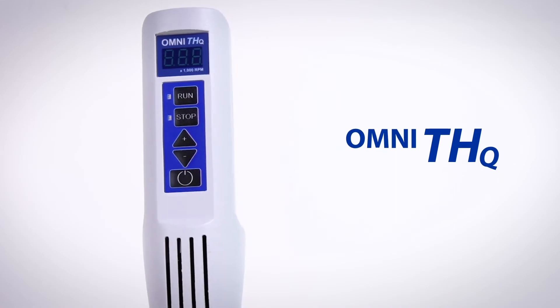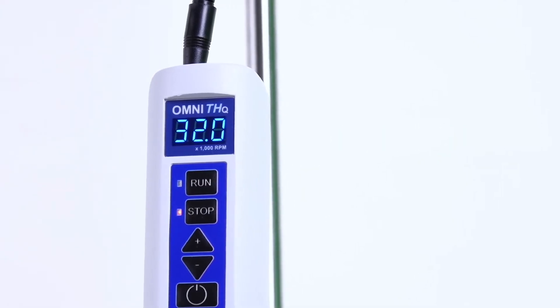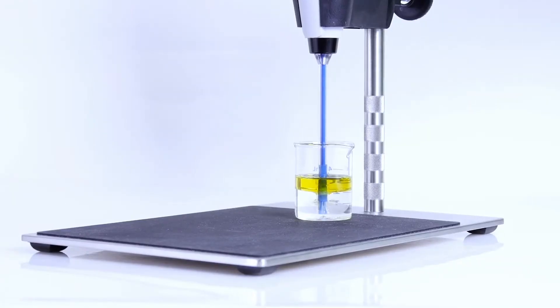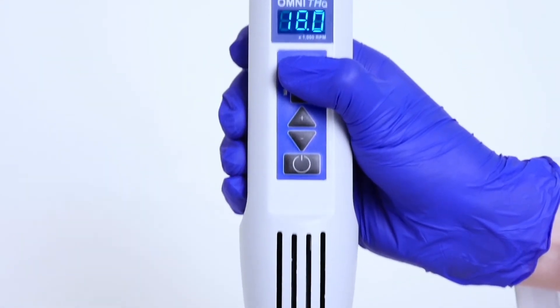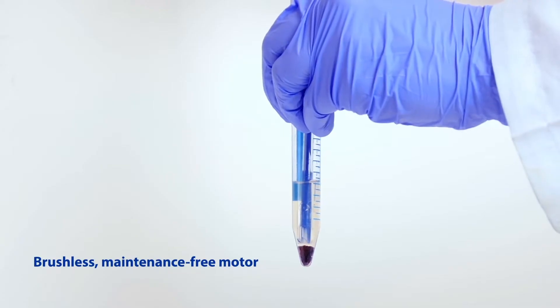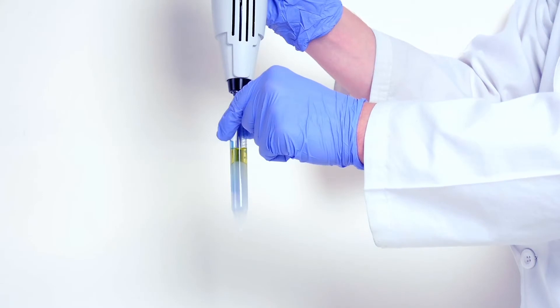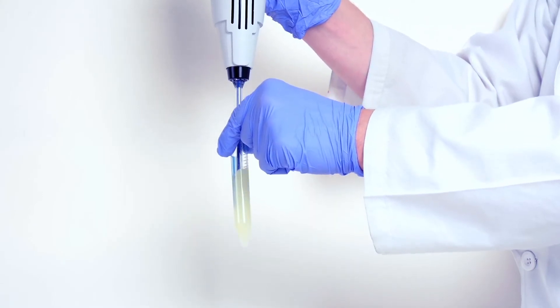The Omni THQ digital tissue homogenizer ensures ultimate repeatability for standardized applications within the lab. The integrated digital controls provide accurate results for each cycle and the brushless, maintenance-free motor incorporates constant speed feedback, enabling it to maintain a set speed throughout sample processing.